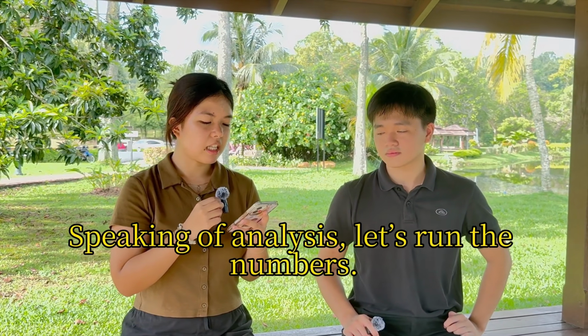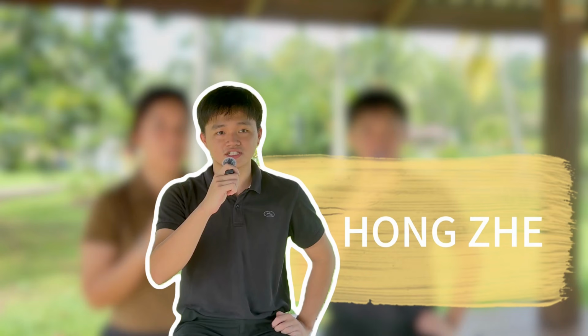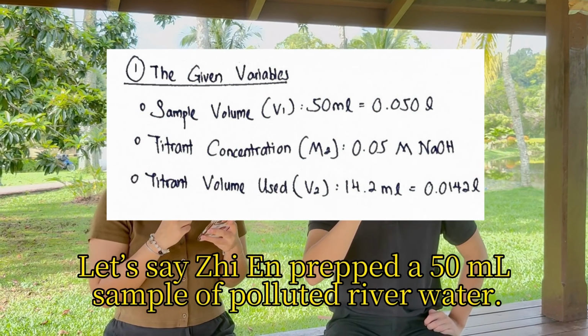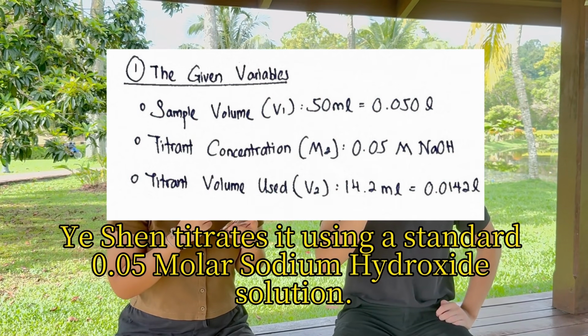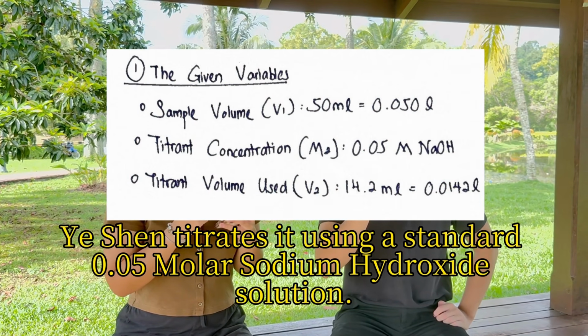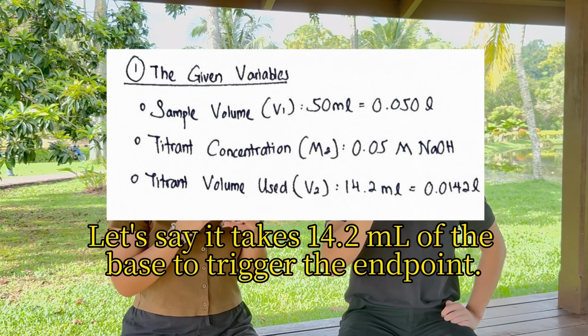Speaking of analysis, let's run the numbers. With our data analysis, Hongze, show us the math. Okay, gladly. Let's say the technician prepared a 50 ml sample of polluted water and titrated it using a standard 0.05 molar sodium hydroxide solution. And let's say it takes 14.2 ml of the base to trigger the endpoint.